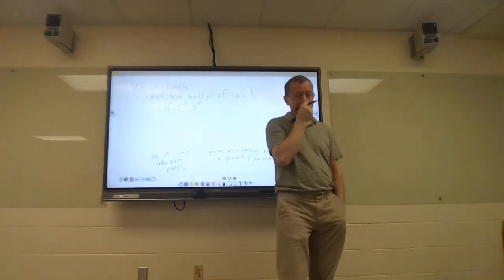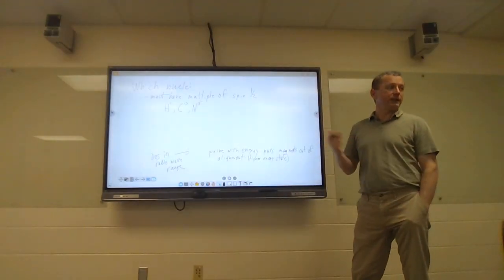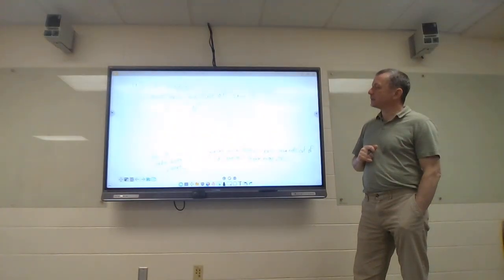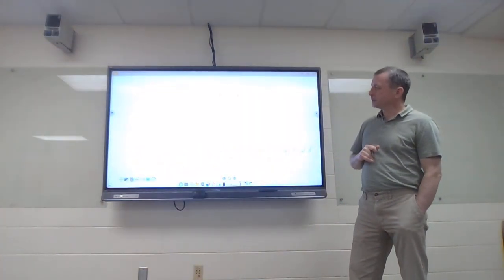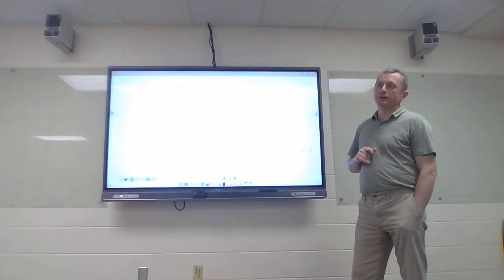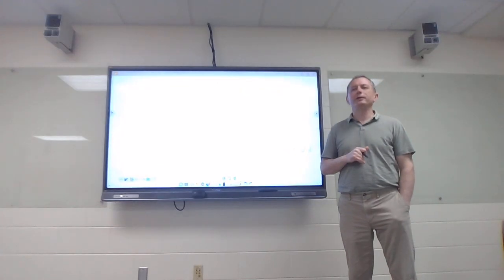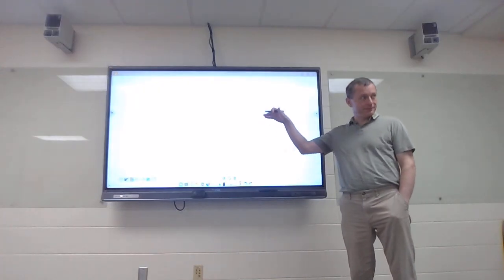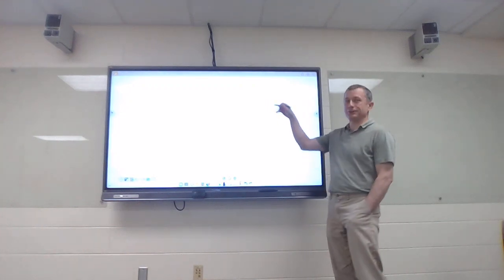Nitrogen's a really tough one because it's nitrogen-15. Nitrogen-14, again, doesn't show up, but nitrogen-15 does. And so we don't see a lot of people doing nitrogen NMR. I don't know of anybody doing an oxygen NMR. Oxygen-16 is not a spin 1/2, so you will not see oxygen.